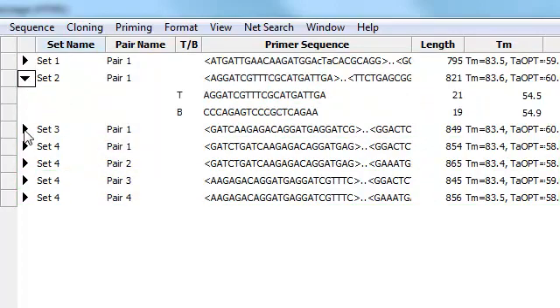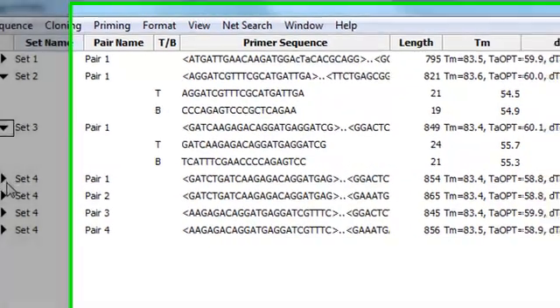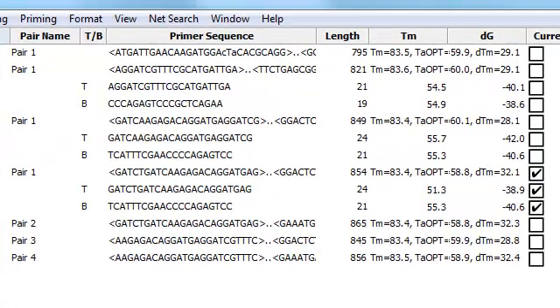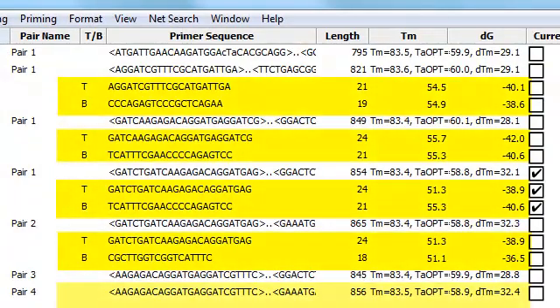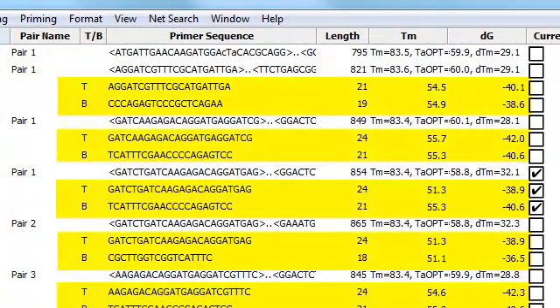If I expand any of these sets, I can see information for each individual primer within the pair.